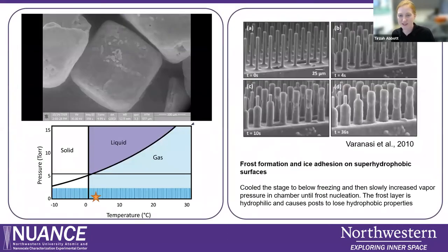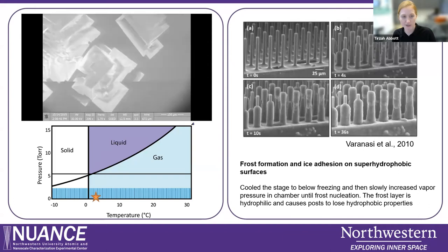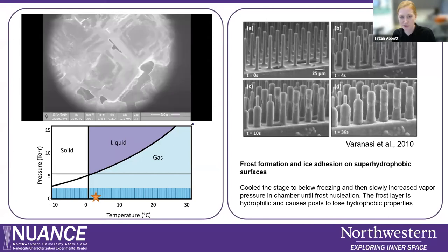A fun example we like to use when training is just dissolving and re-precipitating salt. In this video, you can see salt grains. We've lowered the temperature of the stage to about two degrees C and slowly started to increase the pressure. As we increase the pressure, we start to condense water, the water dissolves the salt, and then all we need to do is decrease the pressure to re-crystallize the salt. Another really cool example: the cooling stage was used to cool a super hydrophobic silane post sample. As they cooled the stage in the presence of water vapor inside the chamber, they were able to create frost on the surface of those posts.